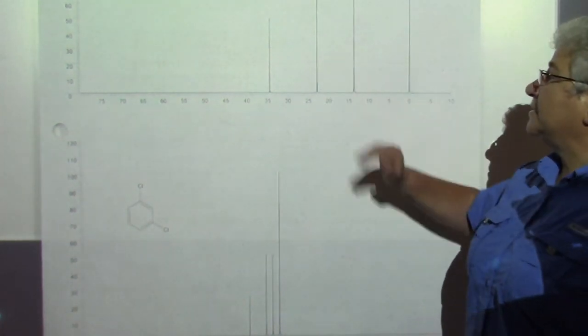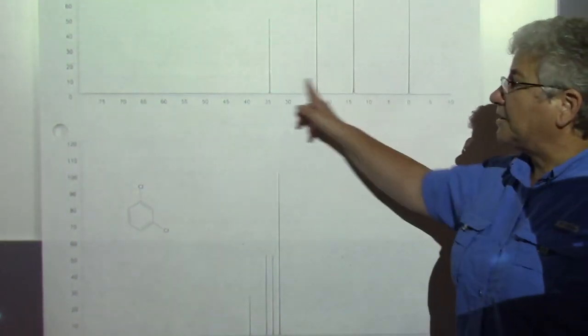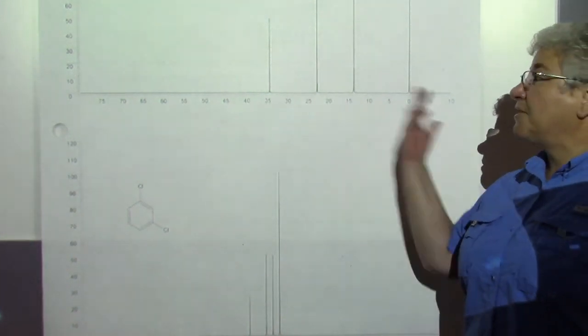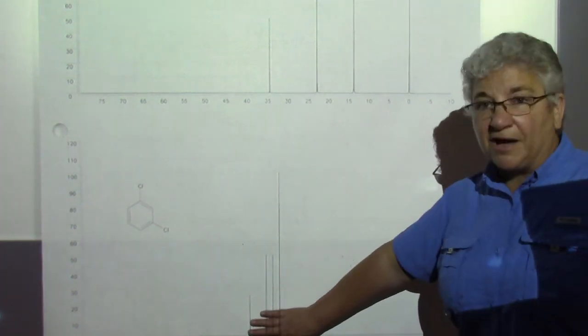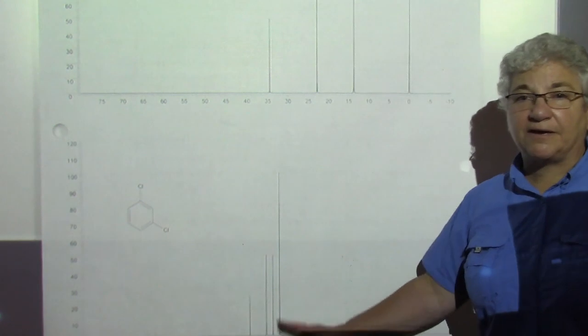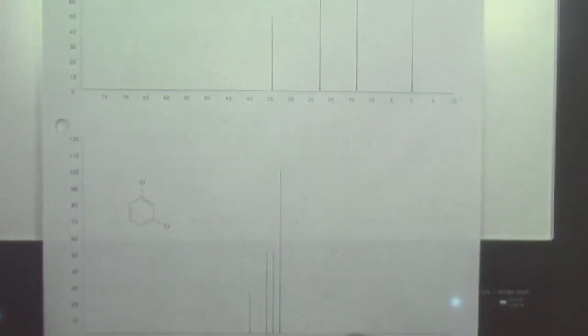And so for pentane, we said there were 3 peaks, but look at their chemical shift, right? Right now they're between 15 and 35. So they're very far upfield, right? They're close to TMS. On the bottom of your spectrum, you have the aromatic compound. And I can't see it on my screen here, so I'm going to move it up a little bit.